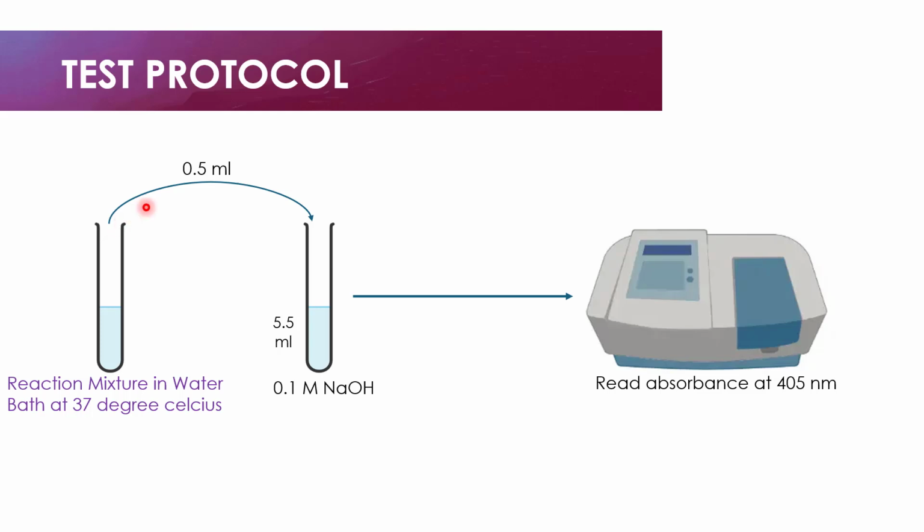After this, we mix the components in each test tube well and read the absorbance at 405 nanometer using a UV spectrophotometer, as seen here.